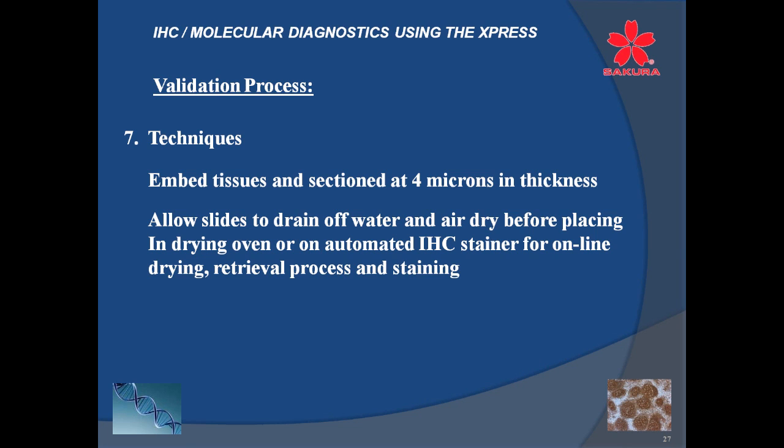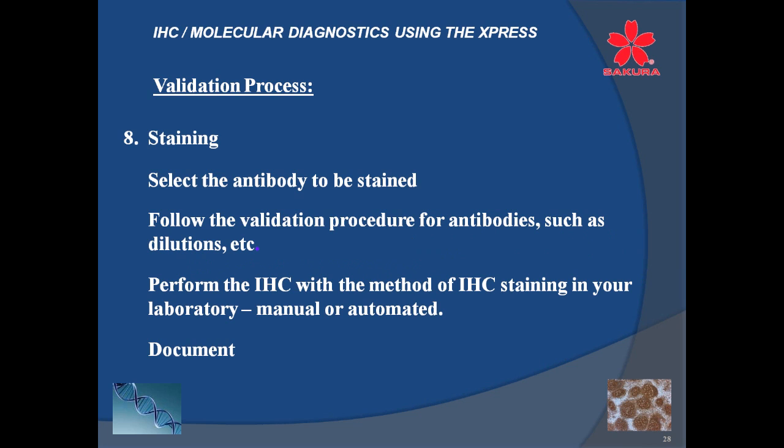And then one thing that I've used to help dry them is, once I put them in the slide rack after cutting, to place a little fan there for just a few minutes. You'd be surprised what 5 or 10 minutes will do to rapidly dry the water. And the tissue section should then be white on the slide. That tells you that the water has been removed and they're ready to be dried in an oven or stained.